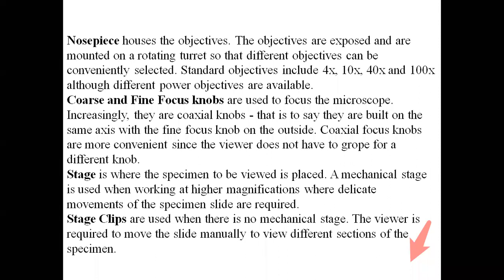Then we have the nose piece. What it does is it houses or holds the objective lenses. The objectives are exposed and are mounted on a rotating platform so that different objectives can be conveniently selected. Standard objectives include 4x, 10x, 40x and 100x.